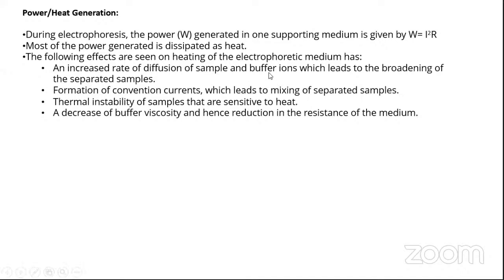Okay, and concentration of buffer ion increasing, will that mean that your sample is going to be carrying the charge more, or will the sample carry the charge less now, according to you? If you have got the situation correctly?